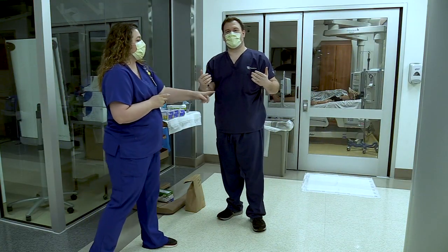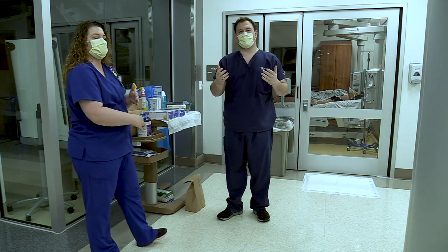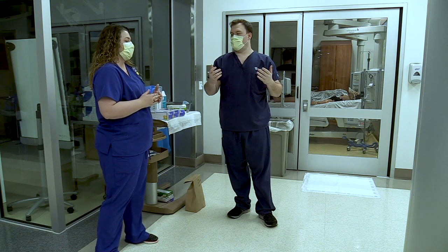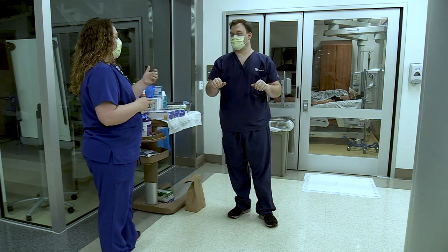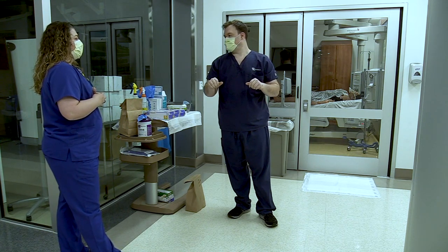We want to make sure that Josh doesn't have any watches, bracelets, bands, or rings on. You want to be bare from the elbow down so that we do not inadvertently hold on to the virus and make sure that everything gets cleaned thoroughly. After he's washed his hands and performed hand hygiene, then we can start the donning process.